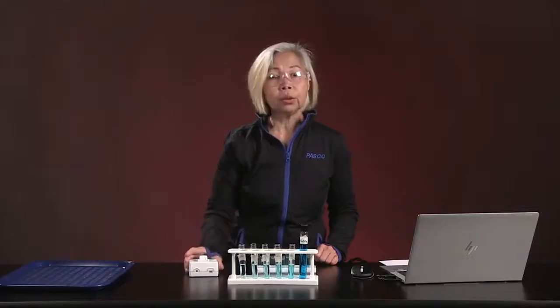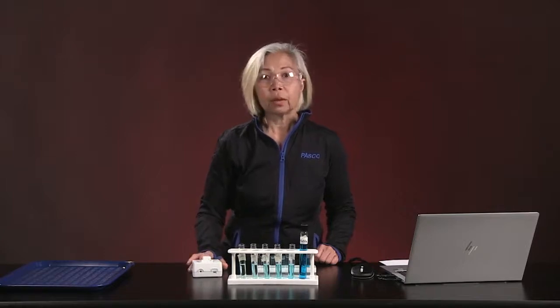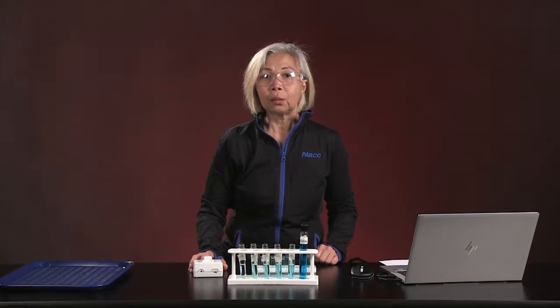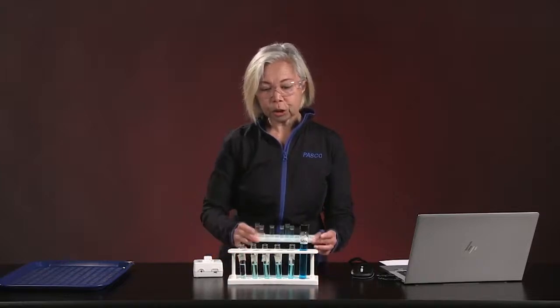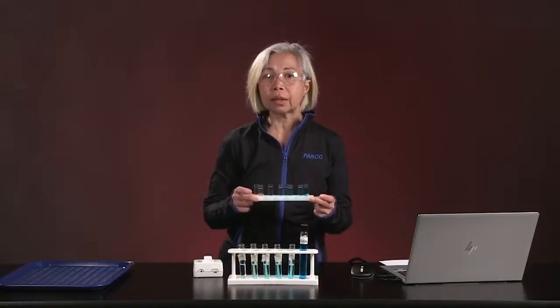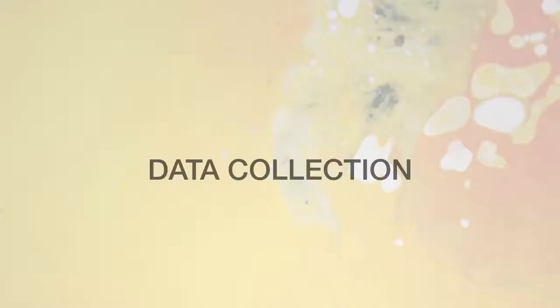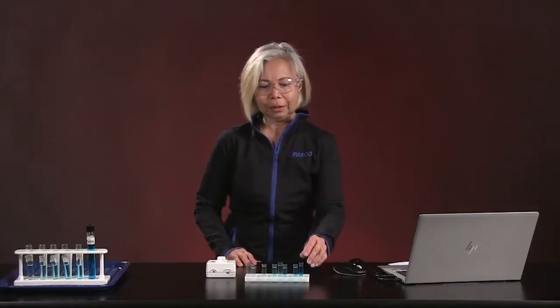We are also going to be using a wireless colorimeter for this experiment. The last thing you want to do is to take your samples of dilutions and actually transfer them into the cuvettes that we're going to be using for this experiment. So let's look at how data is collected.